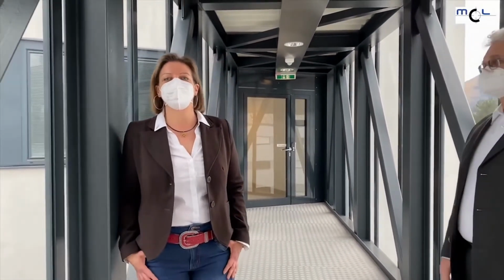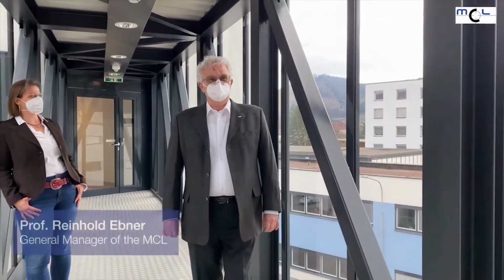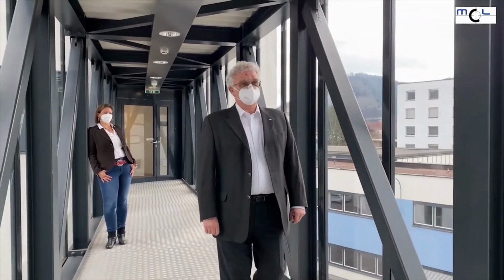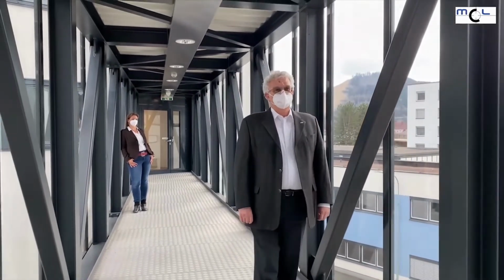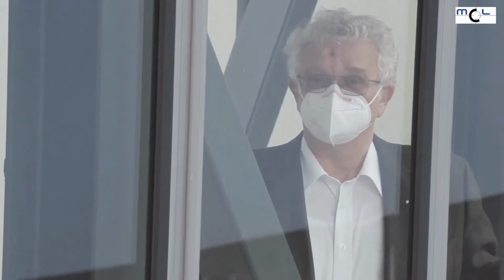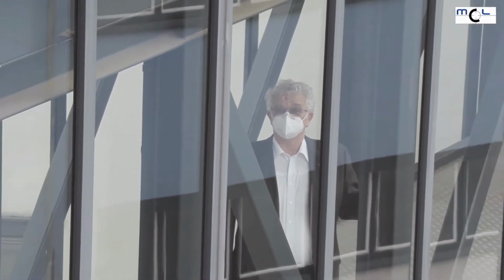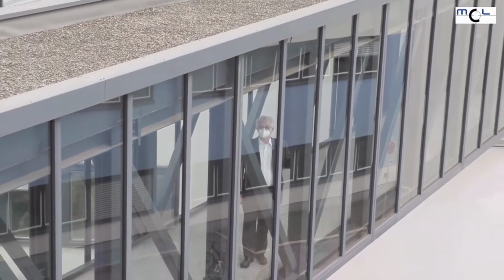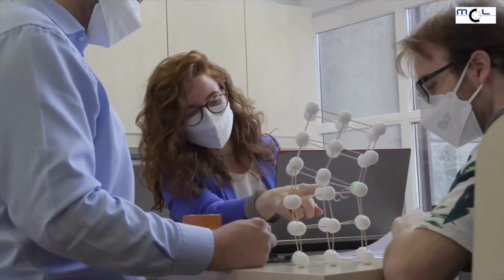At the beginning of our tour, I'd like to give our big boss, Professor Ebner, the possibility to say some words about his MCL. Materials are a central basis of modern life. For instance, mobility, digital communication, energy supply or medical care, as we know them today, would not be possible without advanced materials and their technologies. Manifold applications in industries as diverse as aerospace, mechanical engineering or microelectronics place extraordinary demands on materials. But by understanding the relationship between chemical composition, manufacturing process, microstructure and operational behavior, it is possible to meet even extreme property requirements. The Materials Center Leoben has been conducting cooperative materials-related research for more than 20 years.